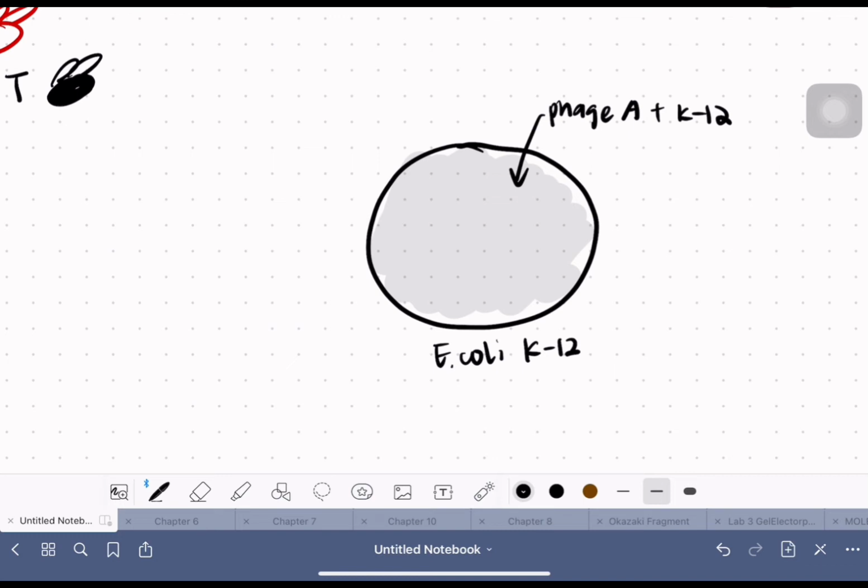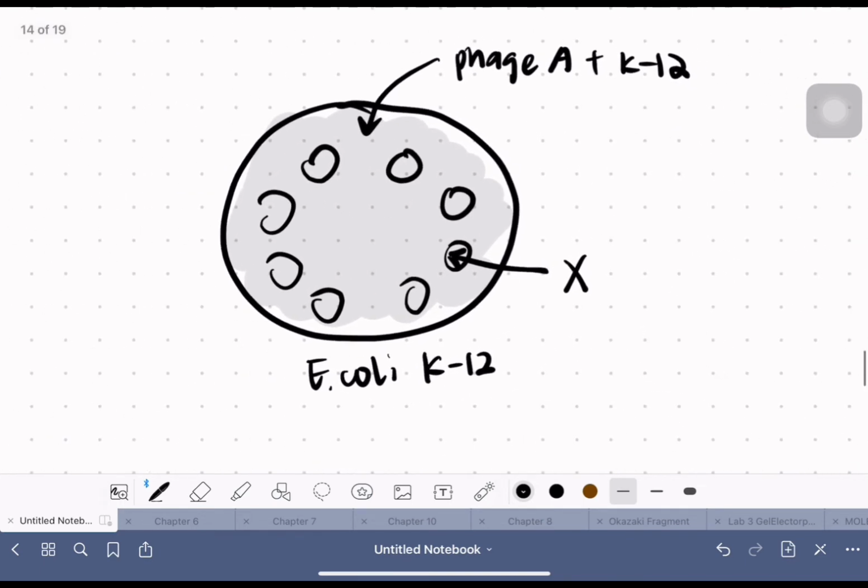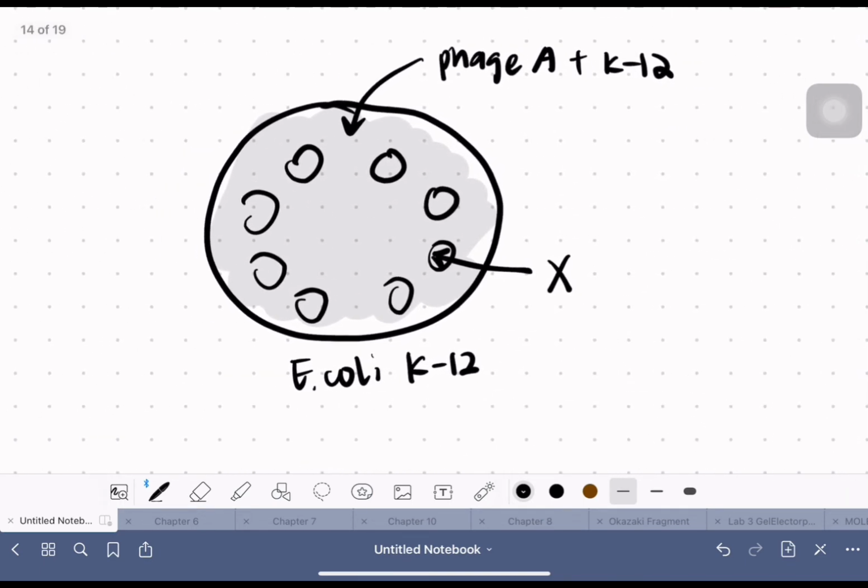So now we have our known mutation, and how do we put our unknown mutation in it? We'll not be putting it in another agarose shell. Instead, we'll just pipette little droplets of our phage with unknown mutation on the gel. But of course, we need to wait for the agarose to solidify, and then we can do it. And these little droplets will be in different concentrations of the phage. That's why you'll be doing serial dilutions for all 3 phages at the beginning. I'll talk about it in a minute.